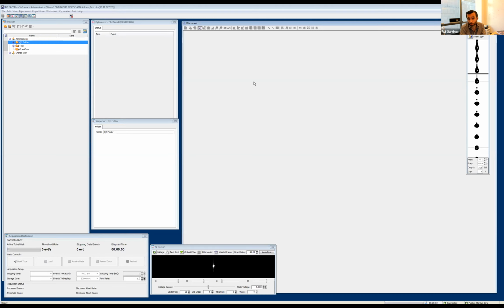Depending on the instrument, I have no idea if setting the value at 0 would be problematic. I'm thinking of the MoFlo, for instance, where we would set the phase anywhere from 0 to 360 degrees, and it doesn't really matter what the value is as long as you have a good stable drop break-off, and it deflects the drops properly, right?